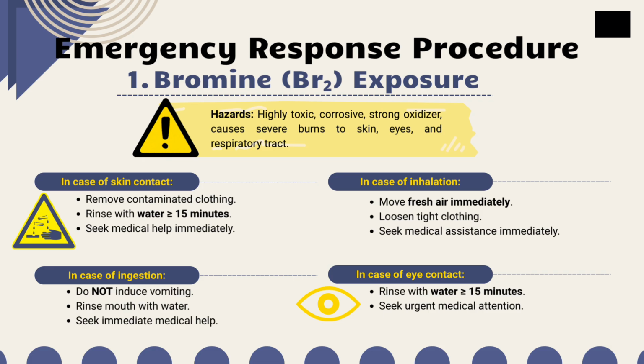Hello, my name is Nurul Shahada. I will briefly explain the emergency response procedure and chemical waste disposal for bromine and tetrachlorocarbon. First, bromine is a highly toxic and corrosive substance that can cause severe burns to the skin, eyes, and respiratory tract. In case of skin contact, contaminated clothing must be removed immediately, and the affected area should be rinsed with plenty of water for at least 15 minutes, followed by medical attention.